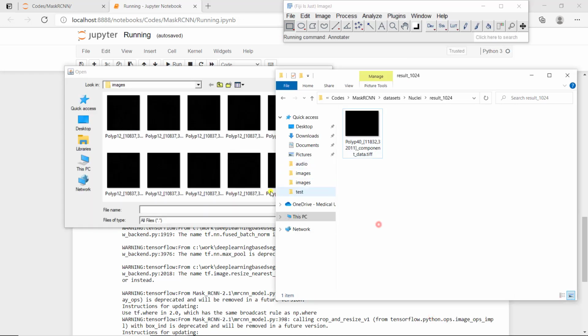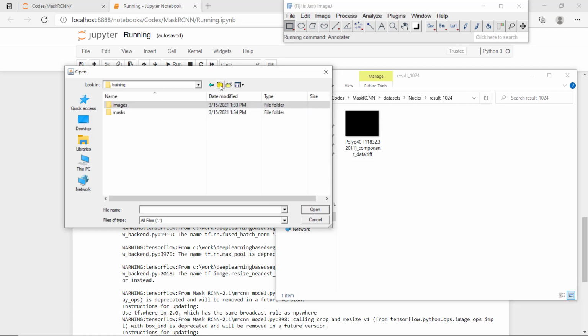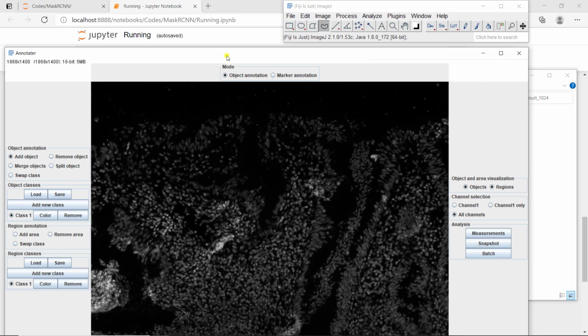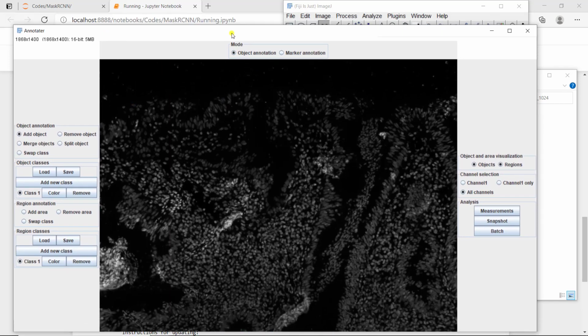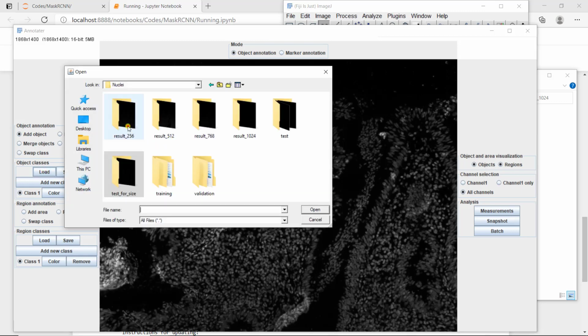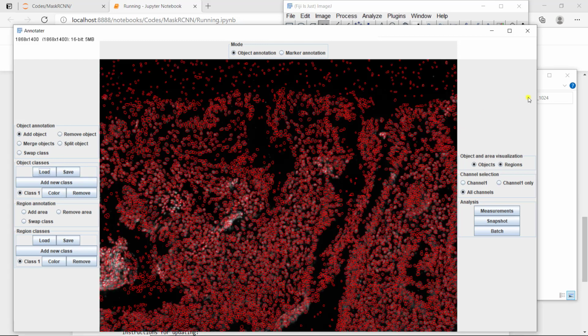Ideally, you have one annotated image that was not used for the training, so you can measure the accuracy with your different parameters and decide on the best parameter by looking at the accuracy. But it's not always easy to do that because you want to use as much annotated data as you have.